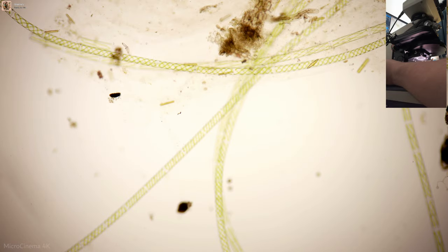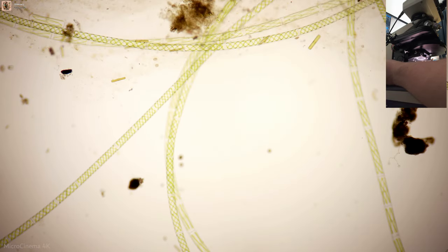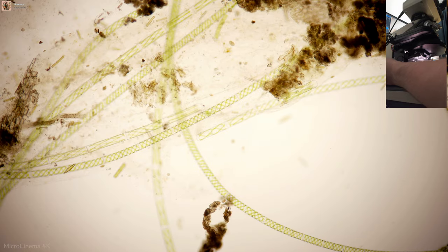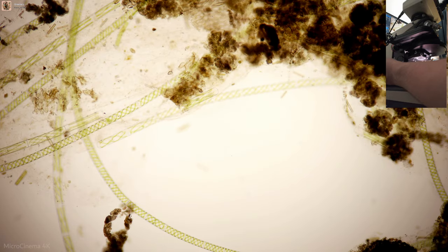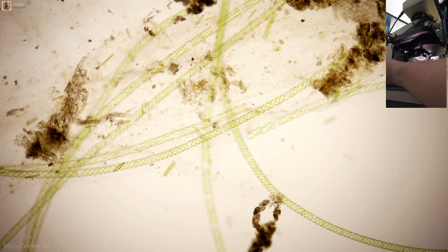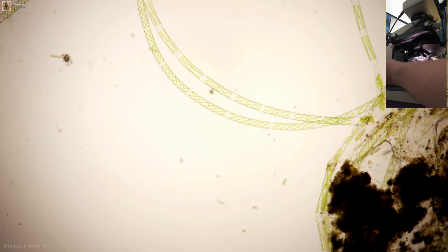It involves just adding one little component to the Olympus Nomarski Interference Contrast Condenser, which is the one that I use. I don't use the universal condenser, what is it, the UCD or whatever that is.